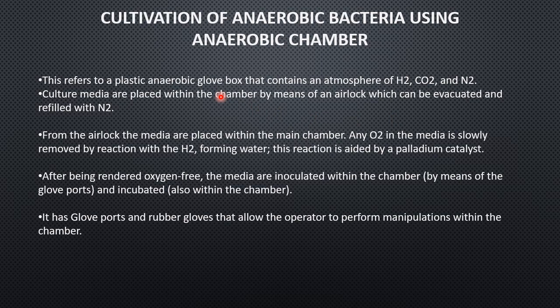So culture media are placed within a chamber by means of an airlock, which is evacuated and refilled with N2. So you cannot just open your anaerobic glove box or anaerobic chamber, keep your plates inside and then close the door and start working. No. So you have to use the airlock. So what is the airlock? The purpose of the airlock is to remove the oxygen that is present in air. So the oxygen is removed, evacuated, and the airlock is filled with nitrogen.